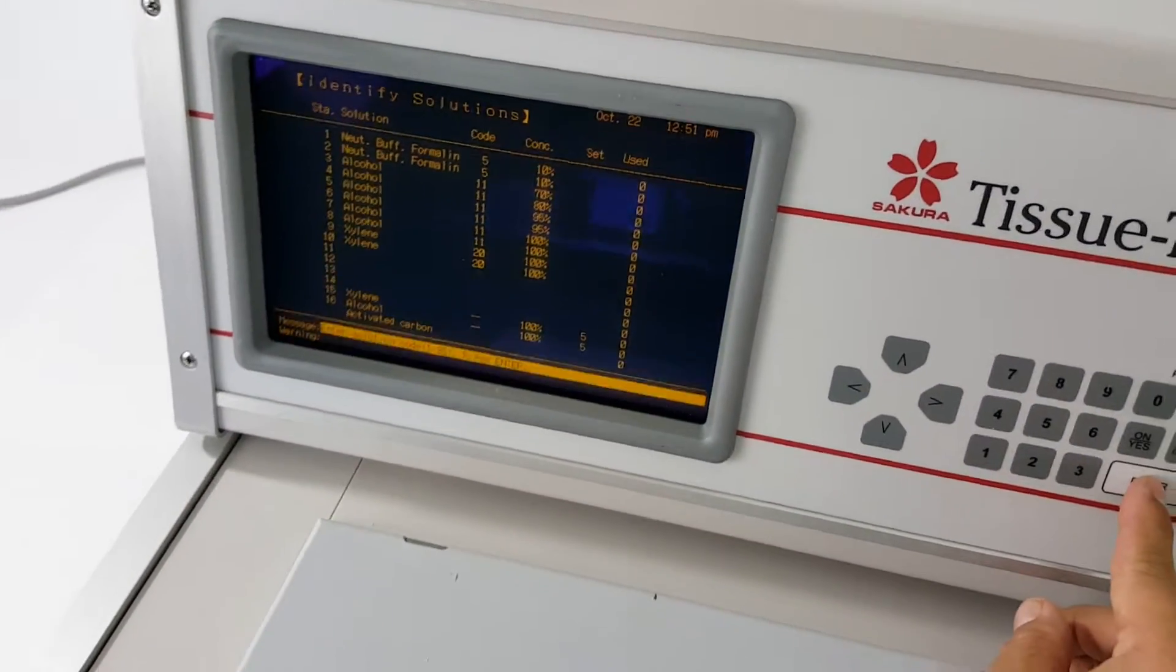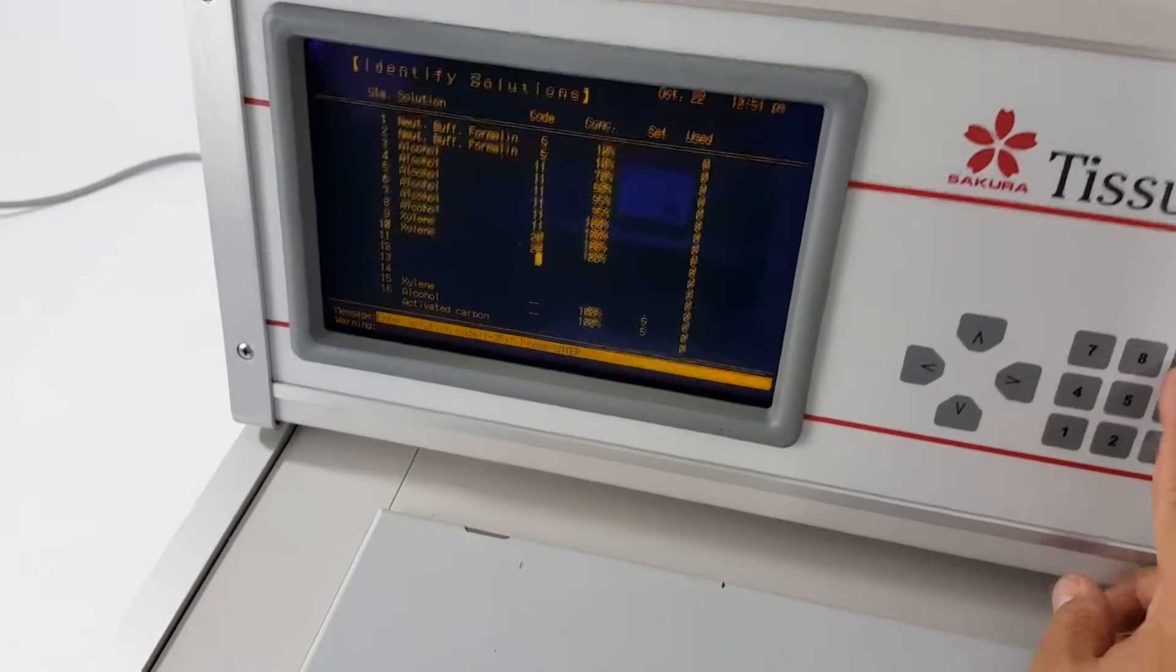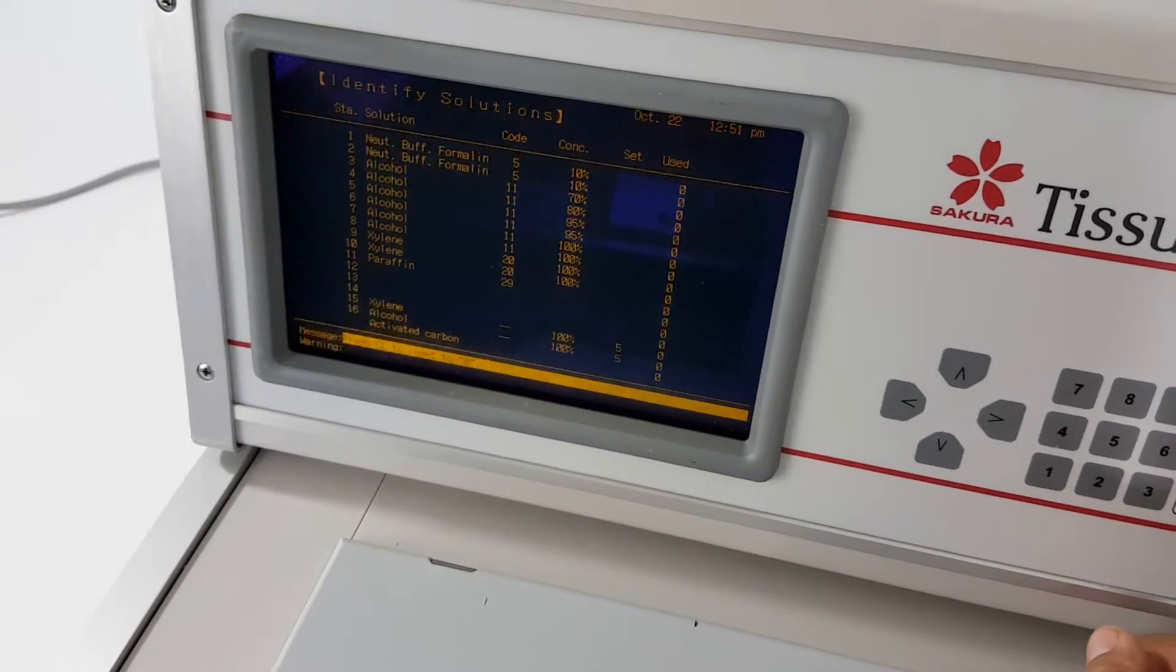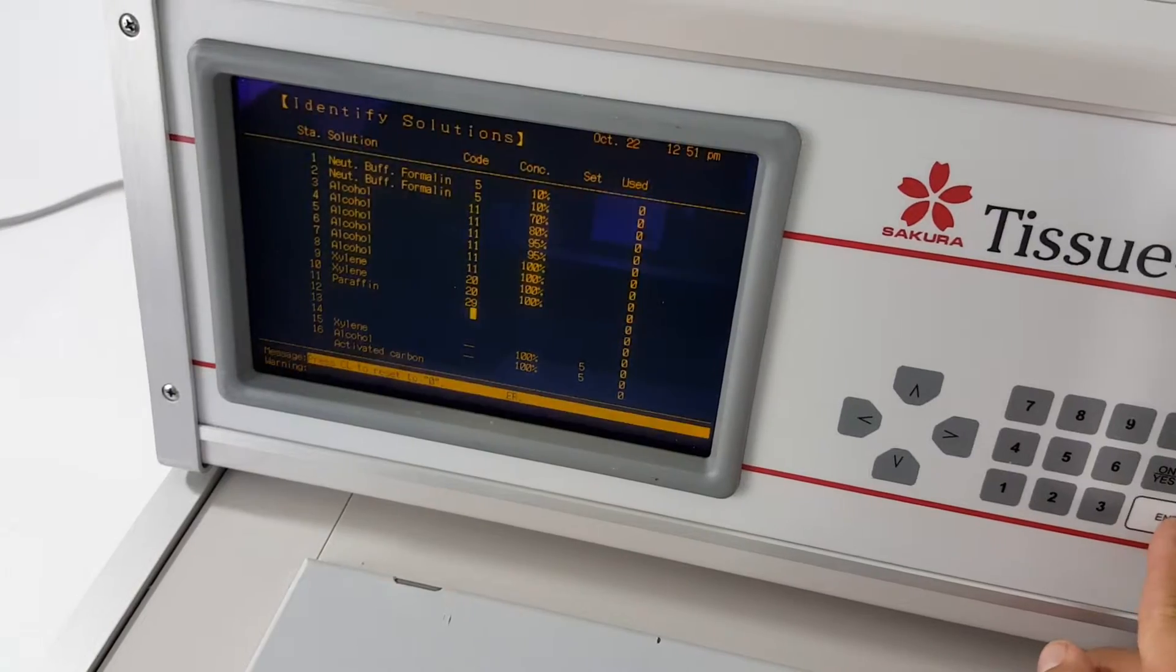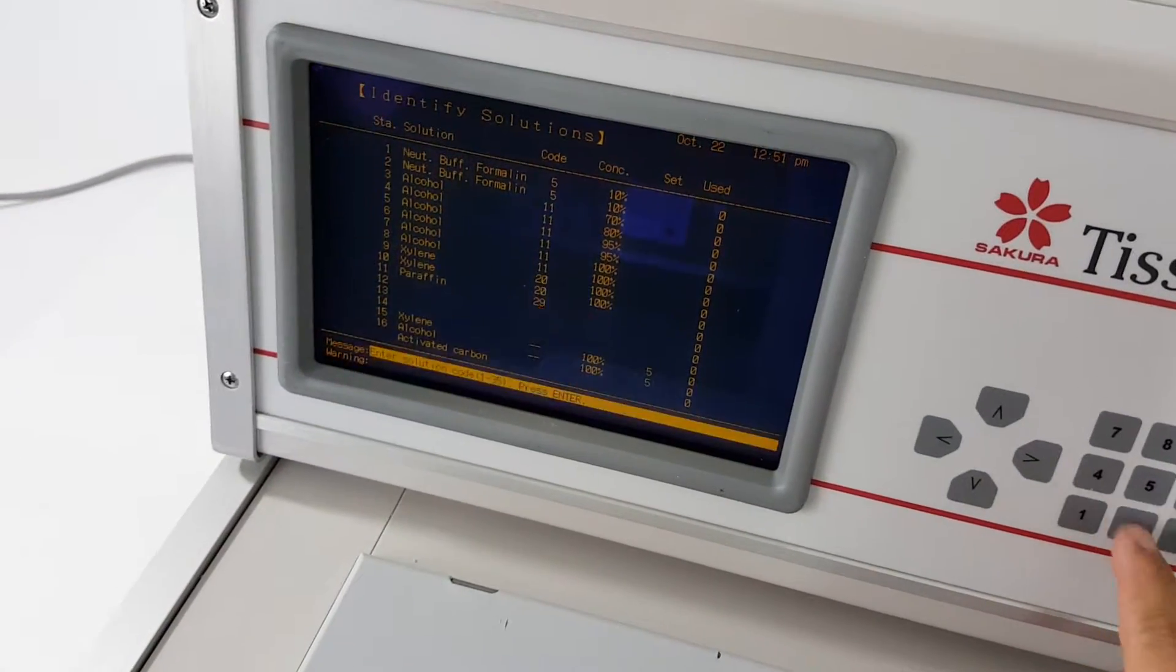And then paraffin is going to be 29. And paraffin is always going to be a hundred percent. It won't even let me change that.